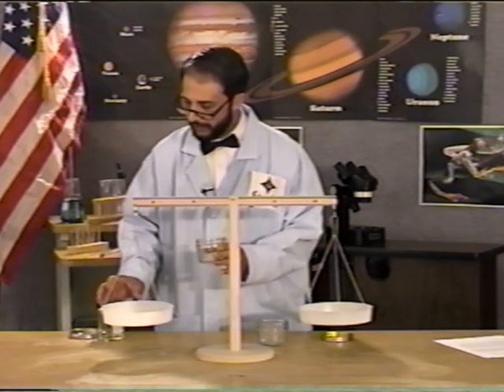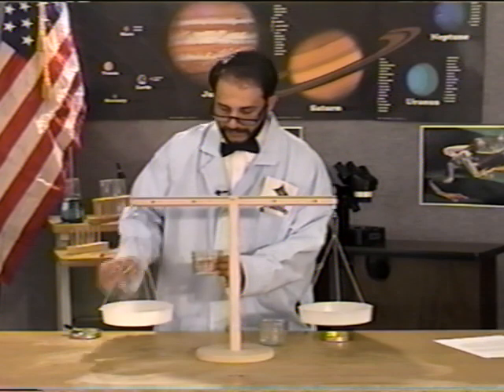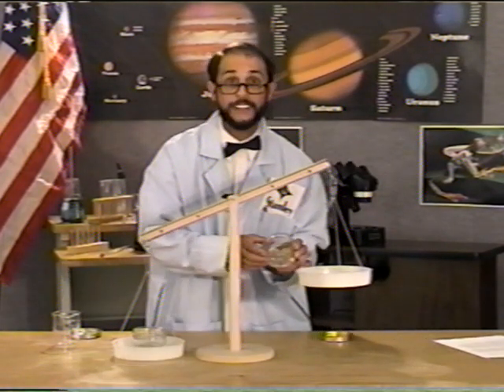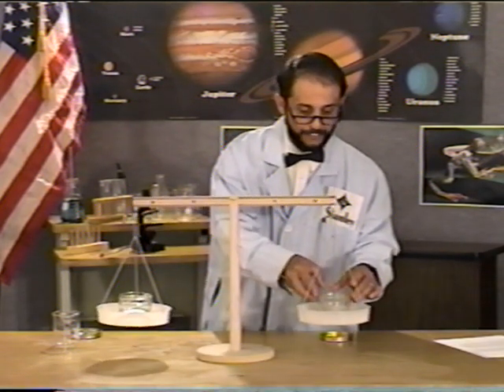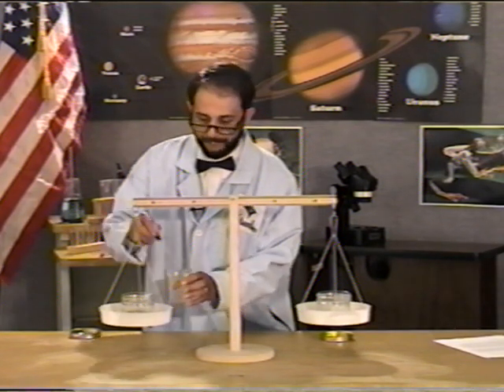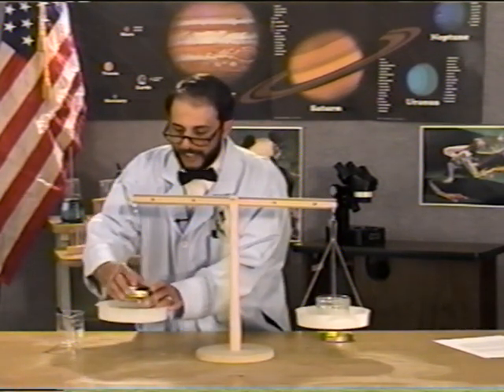In this jar here, I'm going to start with an amount of water that I have in this beaker, and we'll just put it here into this jar and put that into our balance. Over here, we have a pre-measured approximate same weight for now of ice, and we'll put this over here, see if we balance. Actually, we're balancing pretty closely. We might take a drop or two out of the water on this side just to make sure that we don't cheat a bit.